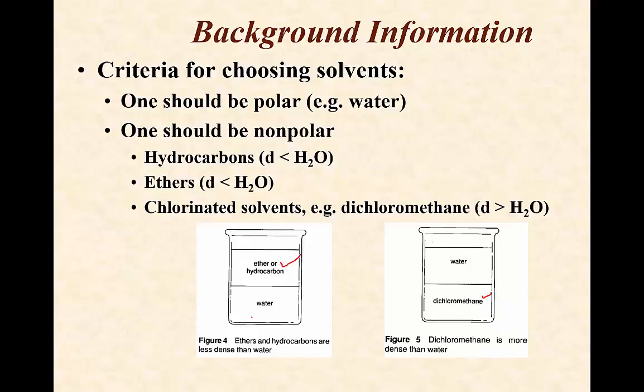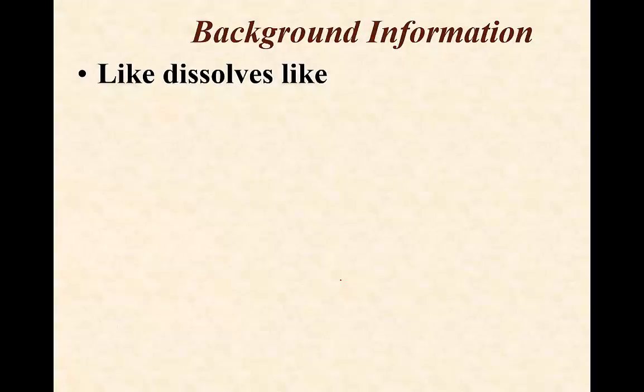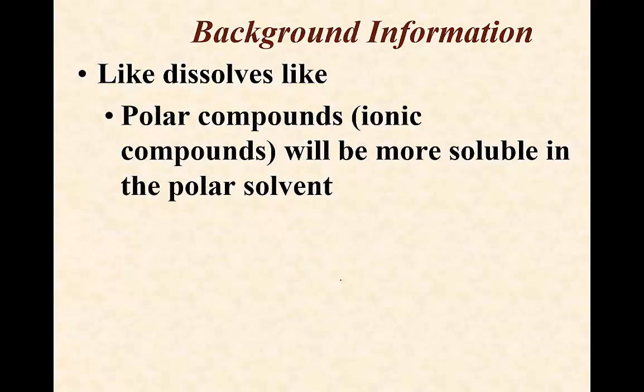So we're going to start out with things in aqueous solution. We're going to extract into the other layer. It will depend on which solvent we choose to use as to which layer we're actually going to focus on after the extraction. We already said that like dissolves like. We're going to use that to our advantage to separate these three compounds that we're going to mix together.